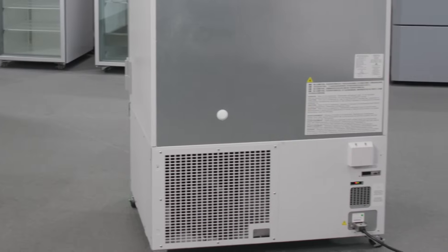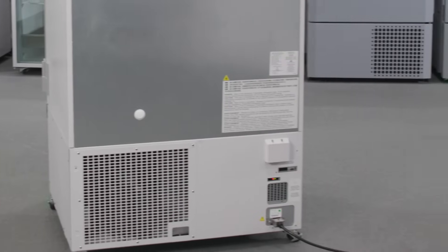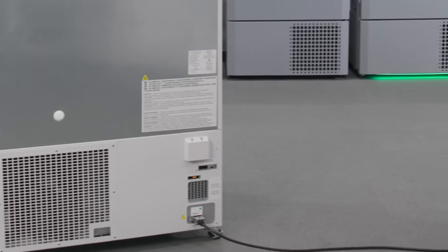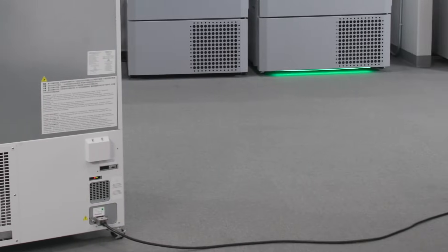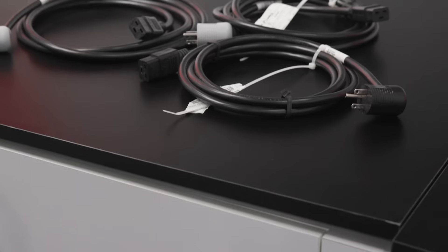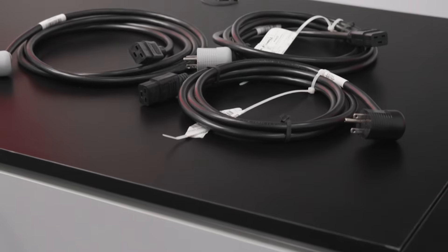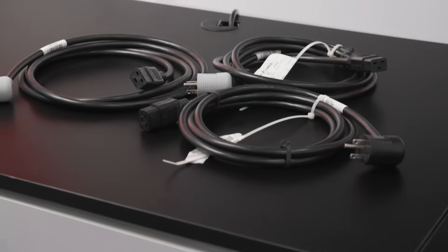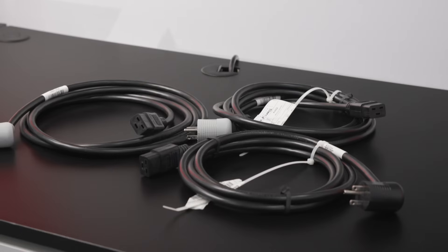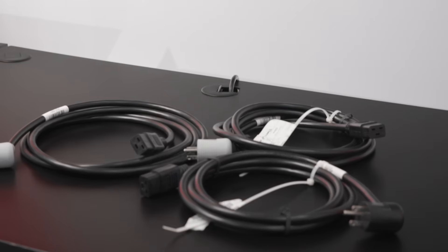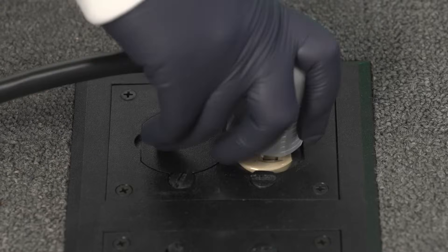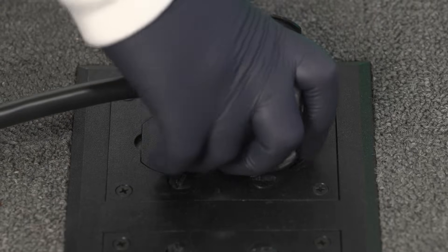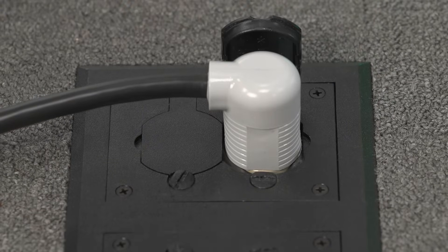What makes this so simple is that the TSX Universal ULT Freezer can operate on any voltage between 100 to 230 volts and either 50 or 60 Hertz frequency. This means it works with virtually any voltage around the globe.